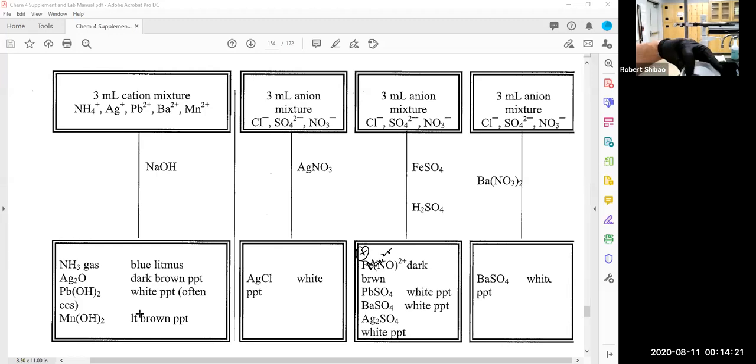It's no big deal. And then we're going to wet the filter paper to make it adhere, just like we did to the litmus paper. Let's wet it, make it adhere. And then let me get rid of the excess water by dumping it into the waste. So now I just got a damp piece of filter paper there, no excess water. I'll throw it down like this.